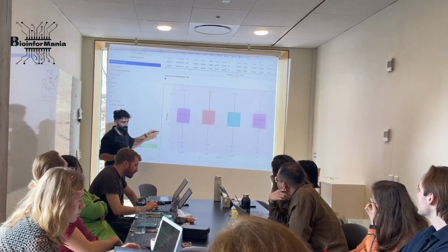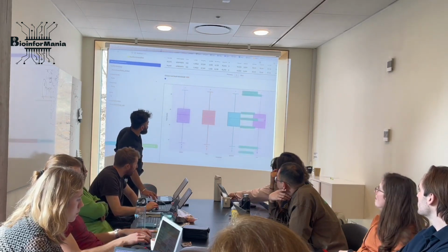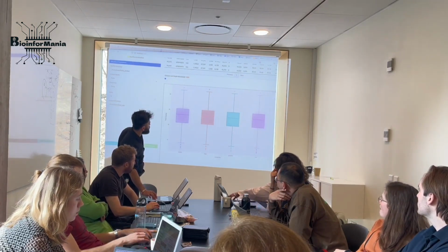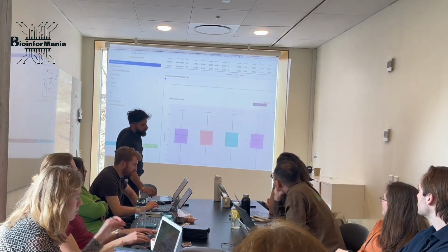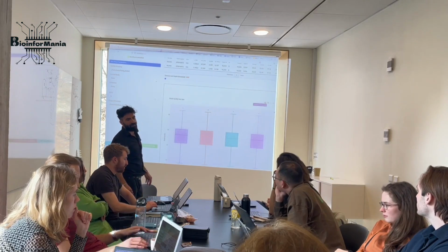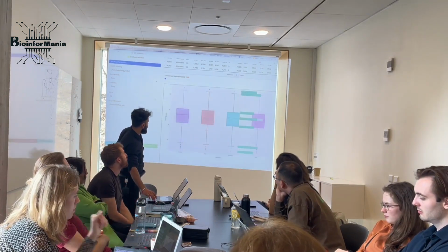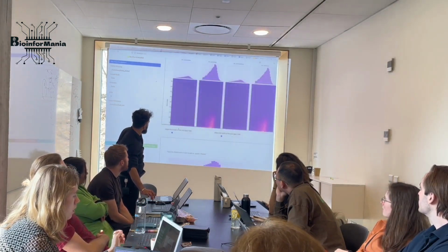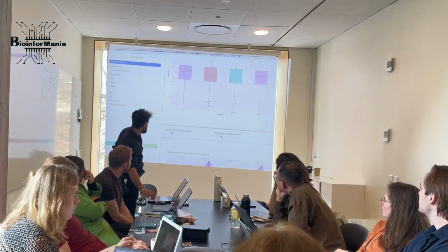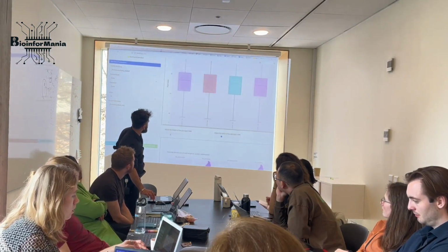And that's great, okay? You can download this plot by, there's some option here, somewhere. Here, you can download it like this. I did not actually work a lot with putting up some download option. Just download it as it is. And if you want to increase the dimensions and whatever, you can actually play with it. Down here, there are some size adjusting sliding bars. Here we go. There we go.